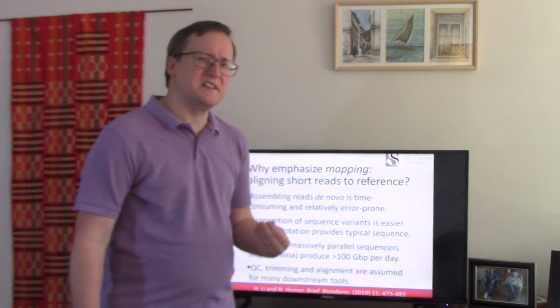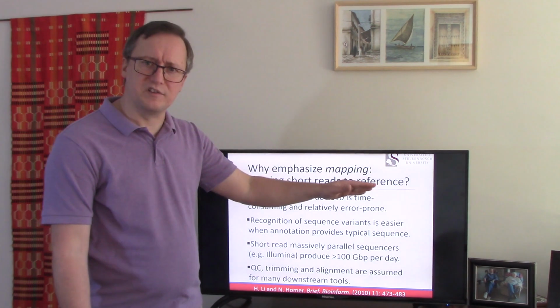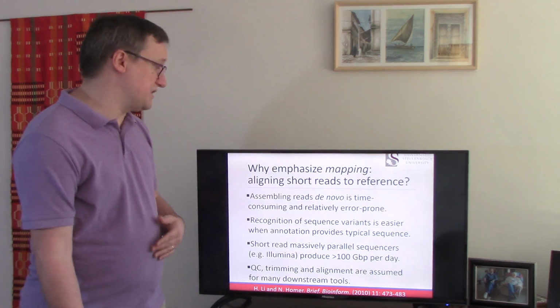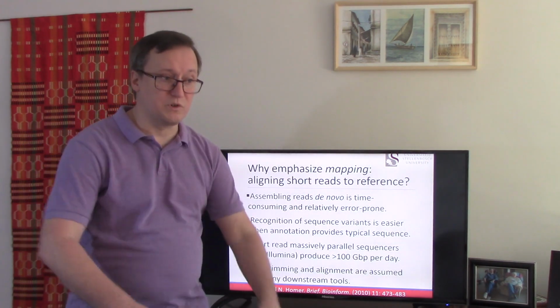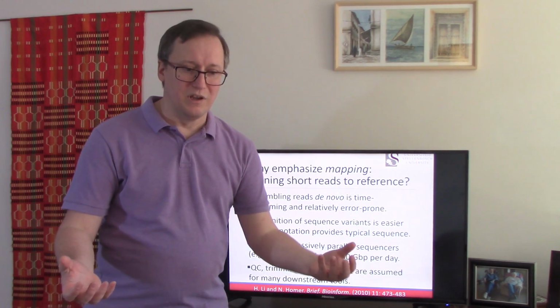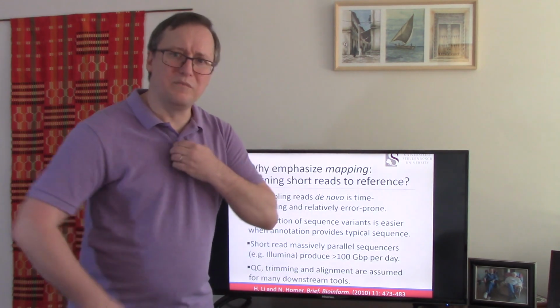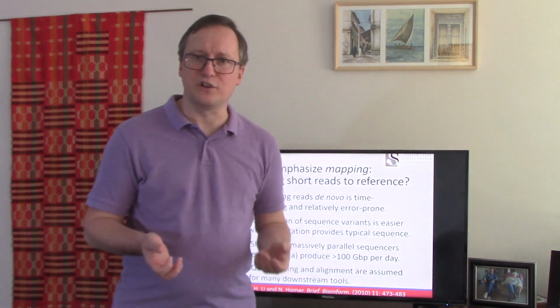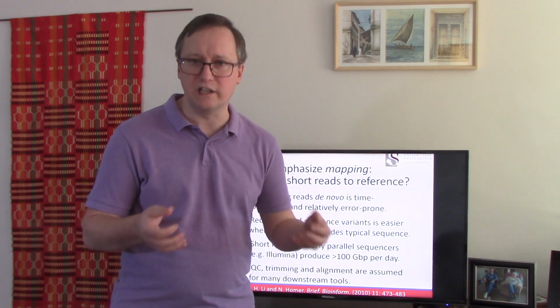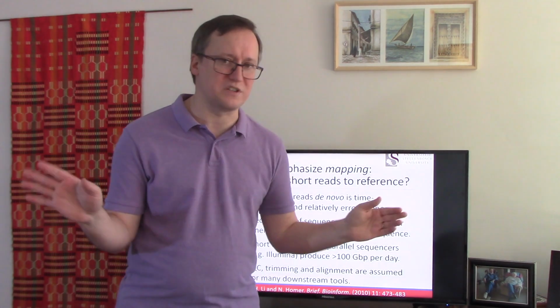So why do we emphasize mapping so much? Why is it that aligning short reads to a reference database sequence is such a popular route? We start with the fact that assembly, starting from scratch, doing a de novo assembly, is really time-consuming and really error-prone. Whereas mapping can be done on a more conventional computer, we frequently find that assembly is going to require a dedicated workstation running Linux with 256 gigs of RAM, and at present, those machines are not found in just every laboratory.